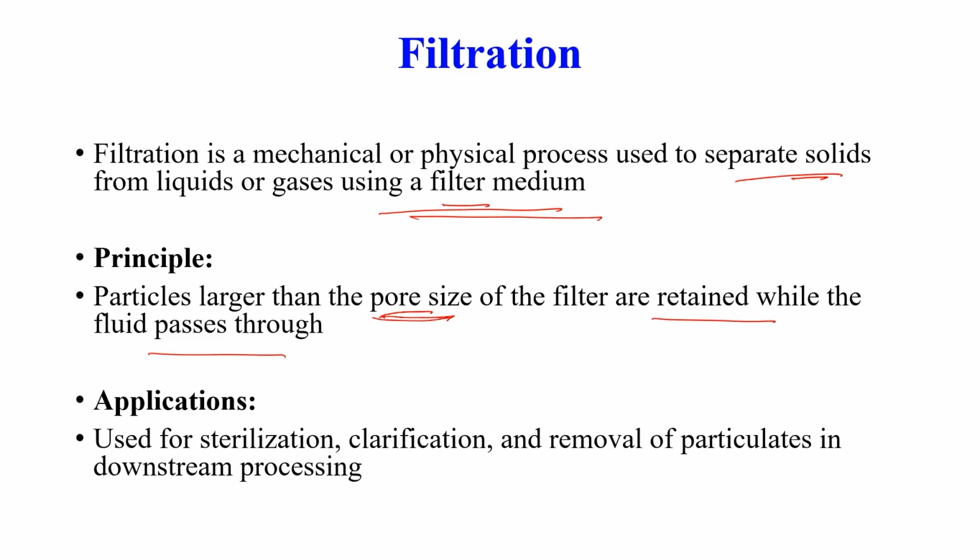In this way we separate solids and liquids, and as I told, it is applied in the removal of particles in the downstream processing. In addition, it is also used for sterilization of cell culture media, particularly for mammalian cells. It is also used for clarification, a step particularly applied in wastewater treatment.